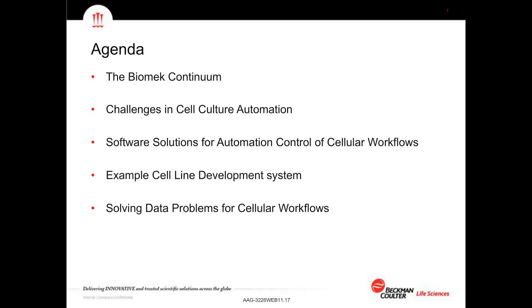And then I want to go into some of the challenges that we face in cell culture automation in particular. We will later on be focusing on a cell line development workstation, but broadly speaking, the challenges that we see when working with cells and trying to culture them are fairly similar regardless of the scale of automation that we're talking about. I then want to speak to the software solutions that we have for controlling those workflows before going into that example cell line development system and some of the devices and challenges that presents to us as well.